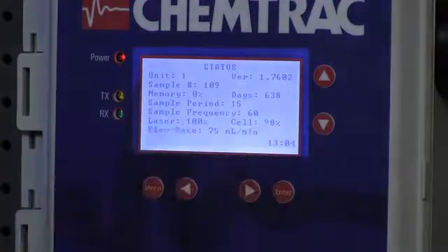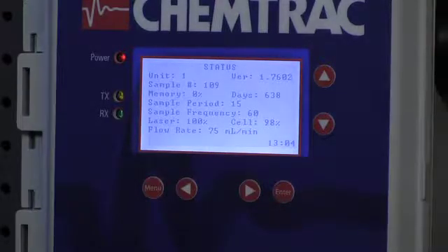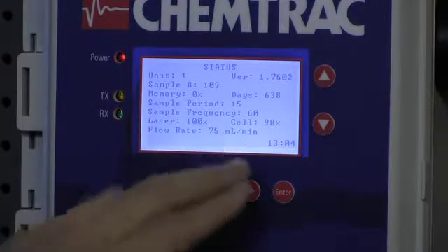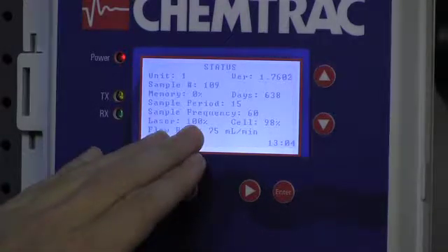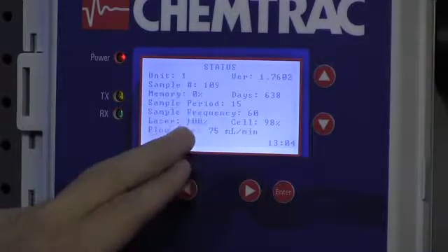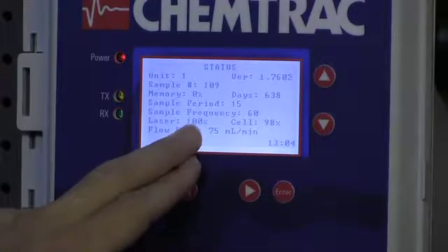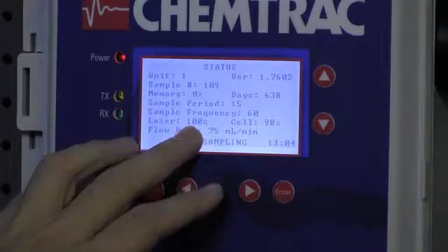The cell percentage tells us the cleanliness of the sensor itself. As this number drops, it indicates that the sensor is becoming dirty and needs to be cleaned. After cleaning, we like this reading to be approximately 95% or higher. The laser percentage itself is a measurement of the efficiency of the laser. Over time, this laser percentage will change as the laser ages. Preferably, it's going to be in the 90% to 110% range.